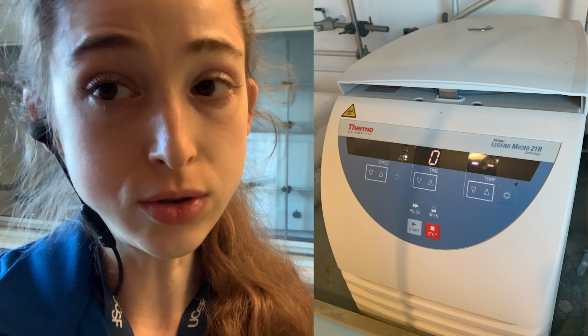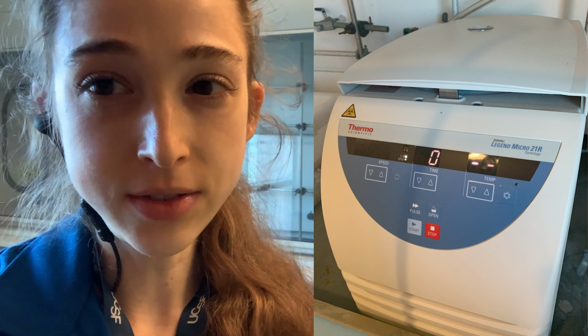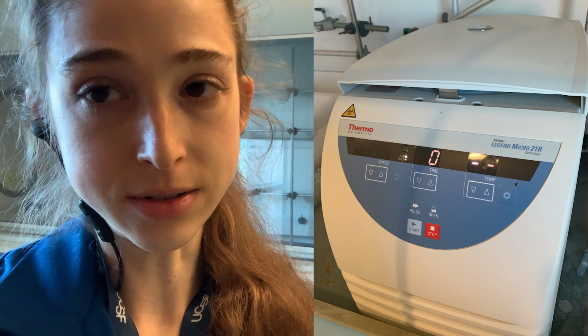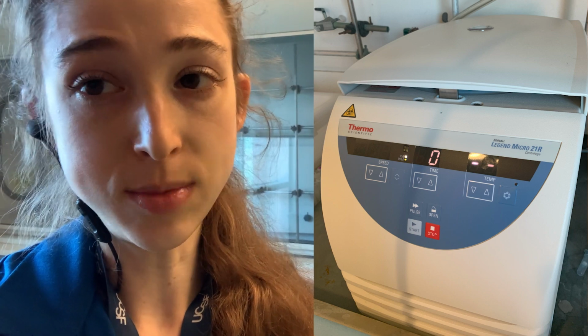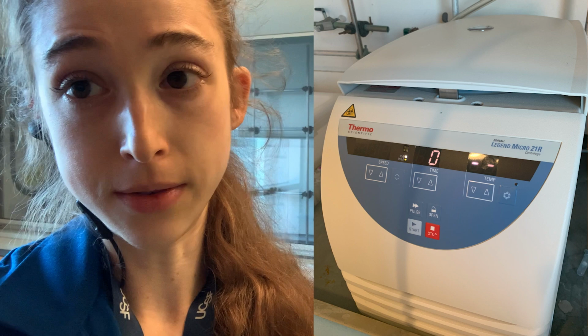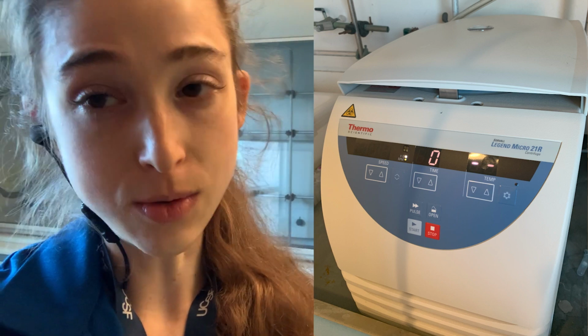So if you're wanting to use it cold, make sure you turn it on ahead of time and press the fast temp button. Make sure there's nothing in there, or else it's going to slow things down or potentially give you an imbalance error if someone left just the balance tube in there or something. Then just press the fast temp and it'll cool itself off, and make sure that the temperature is set to where you want it before you press fast temp, so it actually goes to the right temperature that you want.